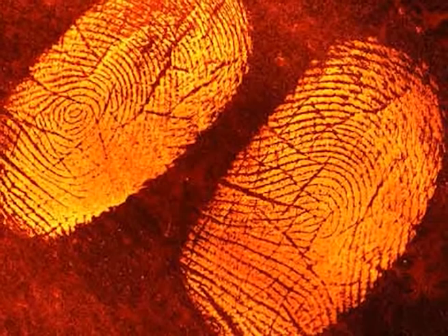The spectral characteristics of the fluorescence produced by DFO developed fingerprints have been investigated. It has been inferred that the fluorescent excitation wavelength occurred at about 470 nanometers, while the corresponding emission wavelength was centered at about 570 nanometers. When illuminated with green light, the developed fingerprints show strong fluorescence, which is viewed or photographed through an orange or red filter. The enhancement afforded due to fluorescence is shown on your screen.